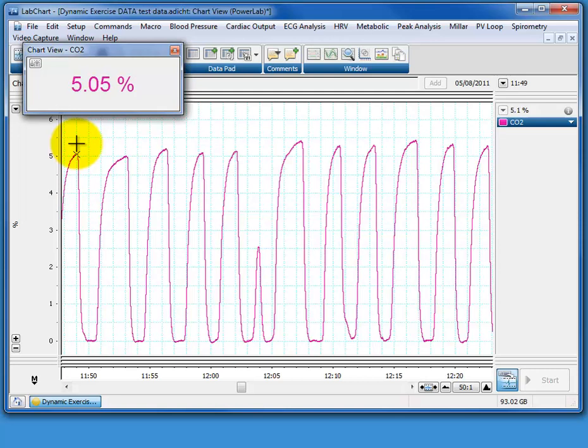We could, as we've discussed in other tutorials, use Datapad. Datapad's very clever in that it'll summarize variables for you and take the peak heights and things like that, which is very useful. However, with Datapad, the one thing it doesn't do, and this is a caveat that must be fairly clear, is it doesn't give you a visualization of what it's doing to the data.